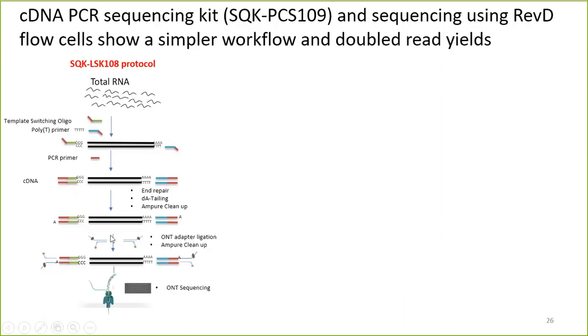And this takes quite a bit of time. You have end repair, the tailing, AMPure cleanups at all the stages, and although it is a very quick protocol, it takes a bit of time.